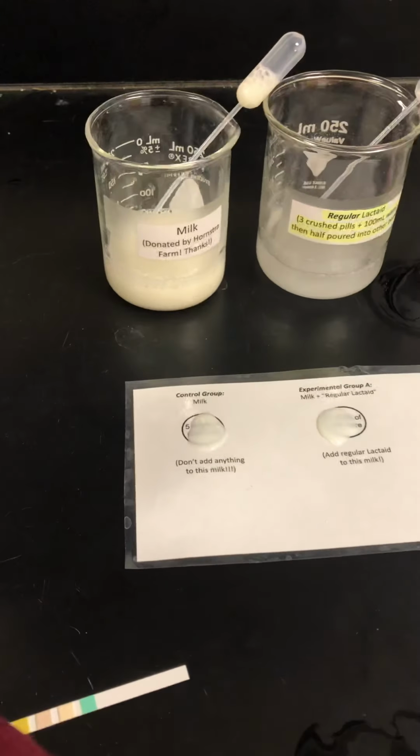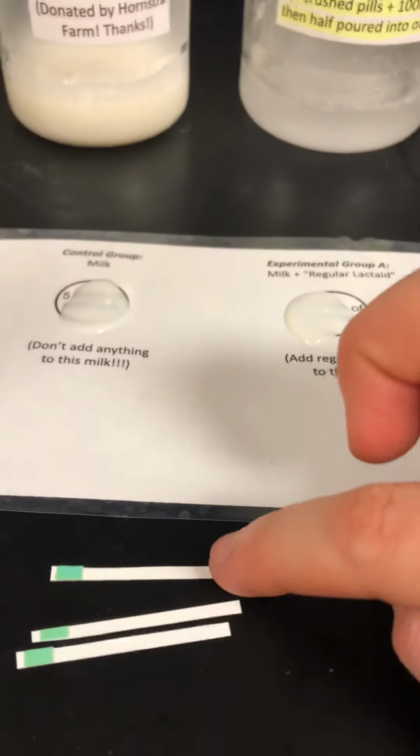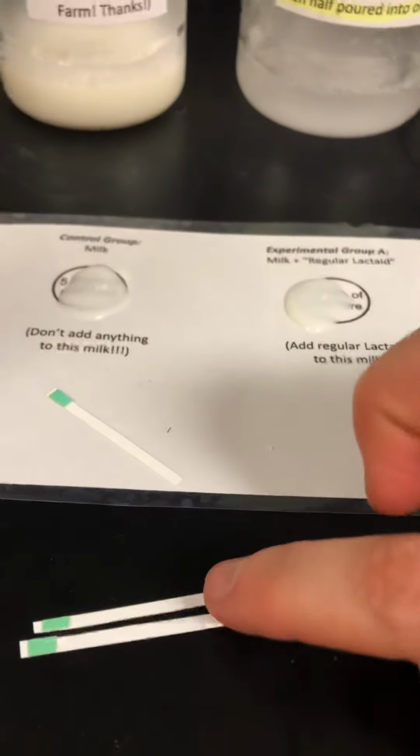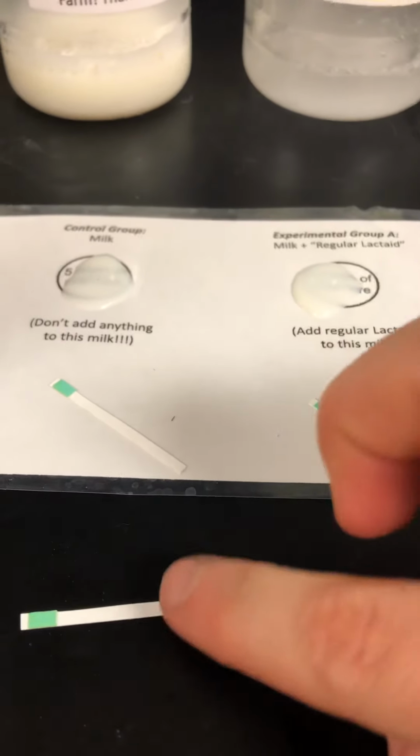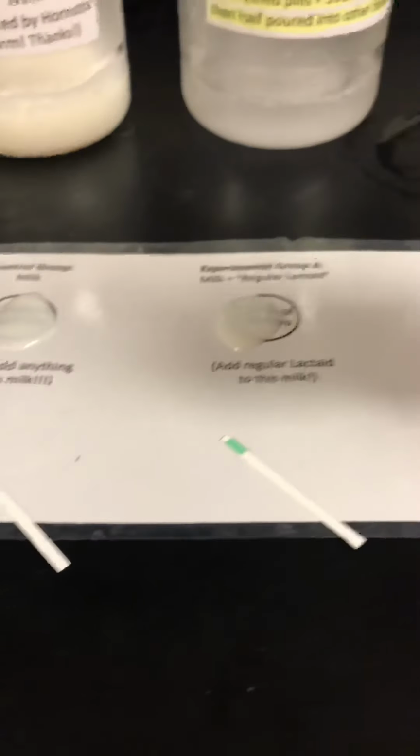In the meantime, we could get our test strips ready. So what I did is I cut off just the glucose test strip, just the bottom one. We don't need the rest of them. And I need 3, one for each of my samples. So what we're going to do is dip the color pad in our milk sample for each of them. Right now we're just giving the enzyme time to work, so if it's actually working, then it will start digesting our milk sugar.